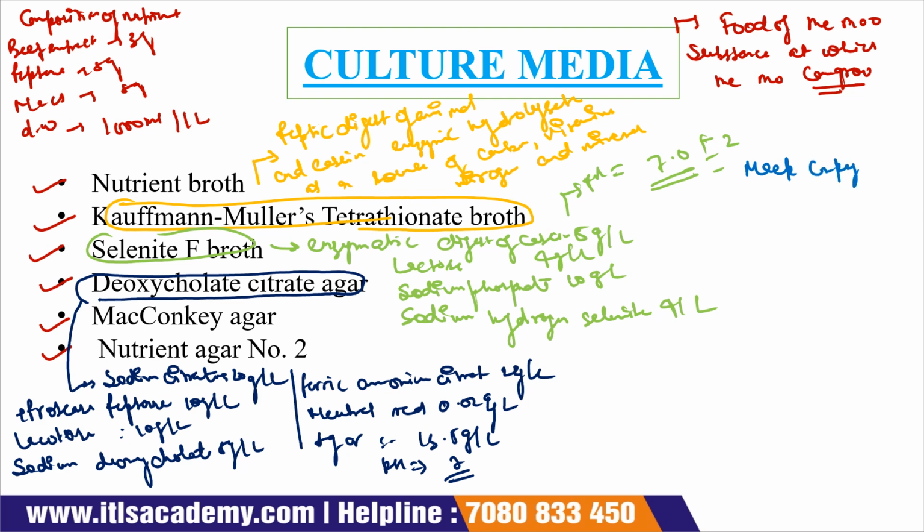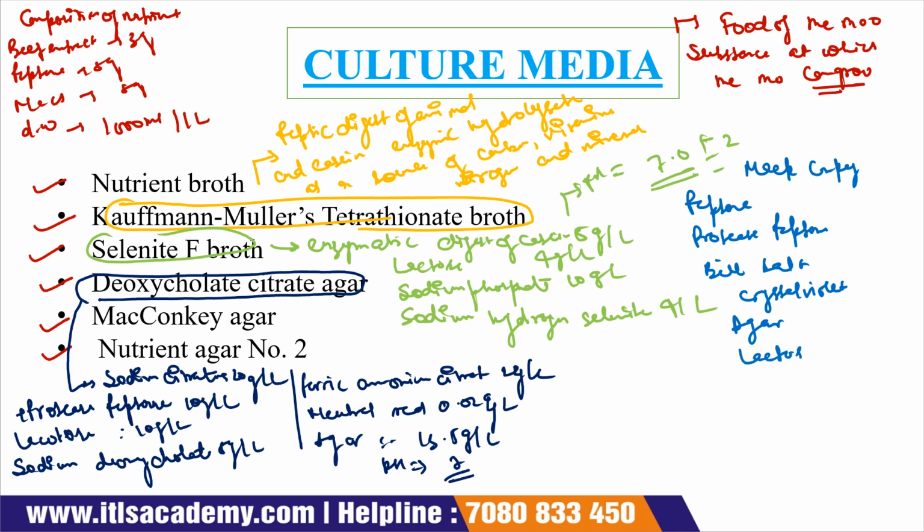Okay, it contains peptone, protease peptone, bile salt, crystal violet, agar, lactose, sodium chloride, and neutral red.